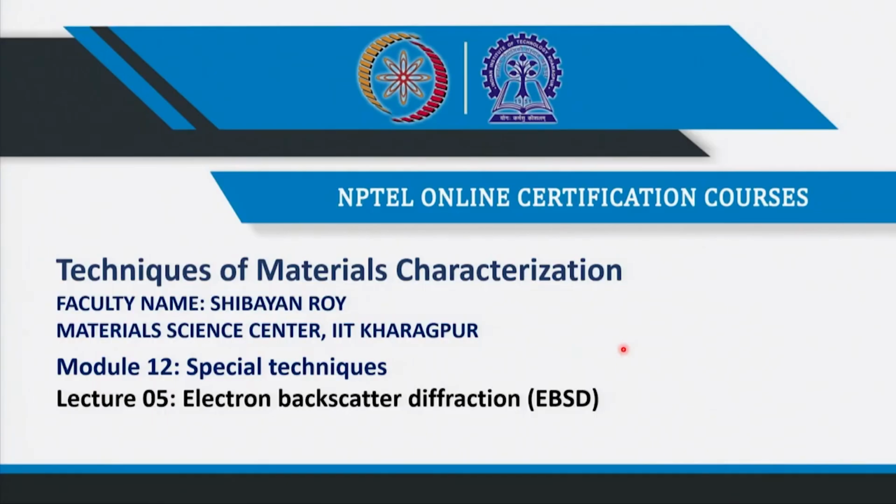Welcome everyone to this NPTEL online certification course, Techniques of Materials Characterization. This is the last class, module 12, and we have so far discussed almost everything that was in the syllabus. We discussed optical microscopy, and electron microscopy, including scanning electron microscopy and transmission electron microscopy, and then we moved on to diffraction based techniques.